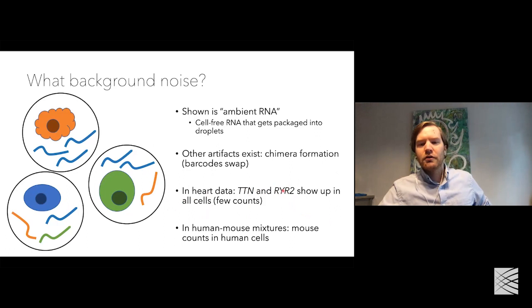You see these markers show up in all cells, maybe just a few counts, but they are in all cell types, which is not something we expect to see.